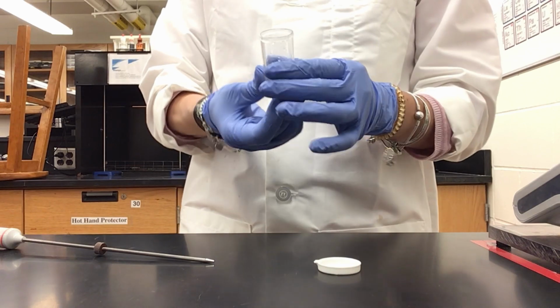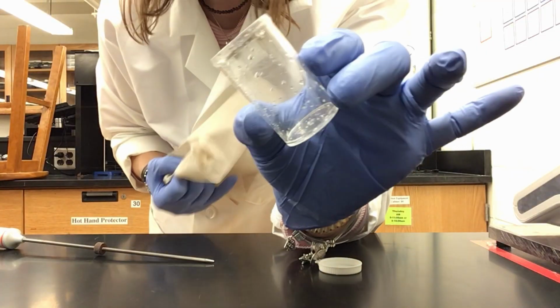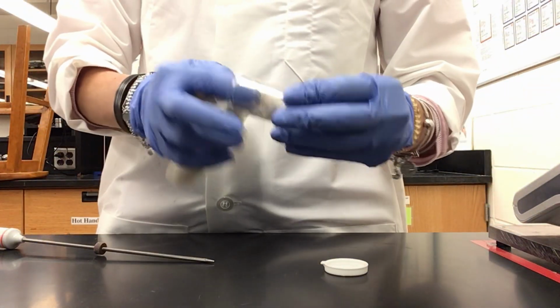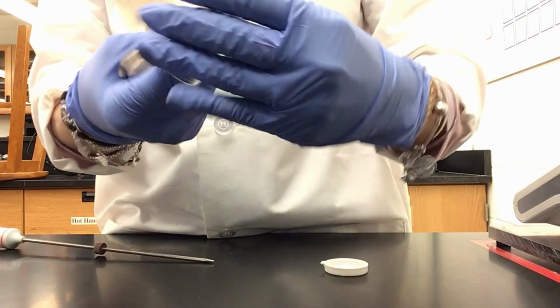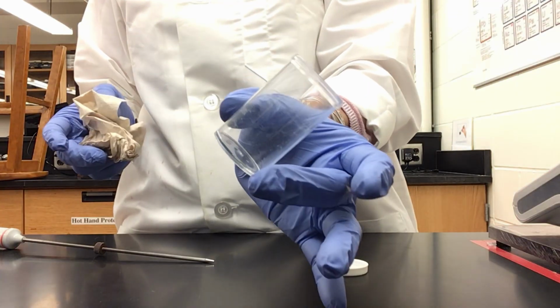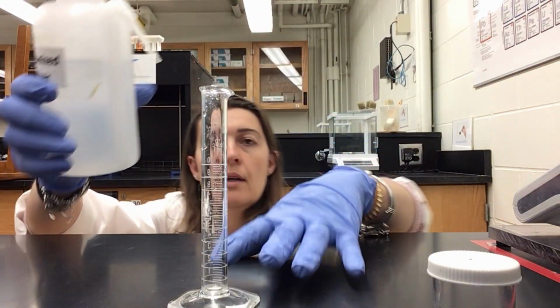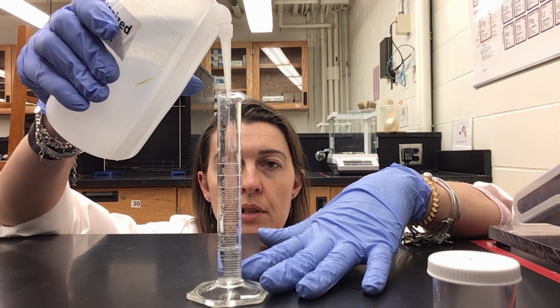Okay, so now I disposed of the water, but as you can see, the vial is wet and still contains some droplets of water. So before I can reuse this, I need to dry it very carefully with a piece of paper. So I just put the paper inside, making sure that it touches the bottom. I am gonna turn it, and even outside, and voila, now it's dry and ready to be used again. So I'm gonna take my cylinder and again do my measurement, the second measurement.